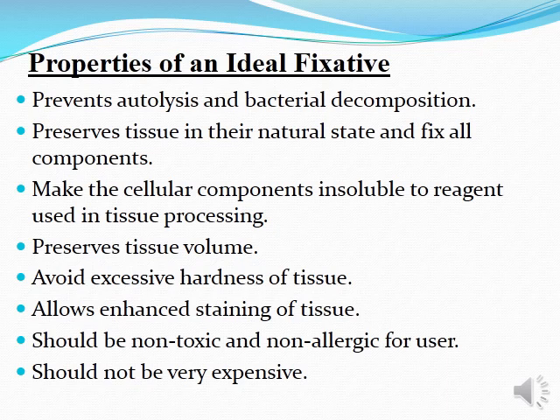So these are the properties of an ideal fixative. It should prevent autolysis and bacterial decomposition, preserve the tissue in its natural state, and fix all the components. It also preserves the tissue volume, avoids excessive hardness of tissue, and it should be non-toxic, non-allergic to the user, and not very expensive.